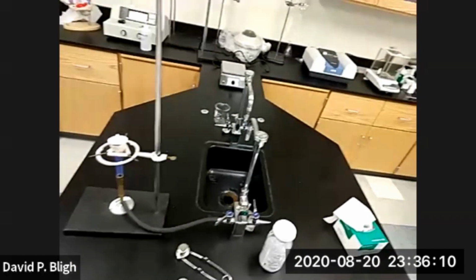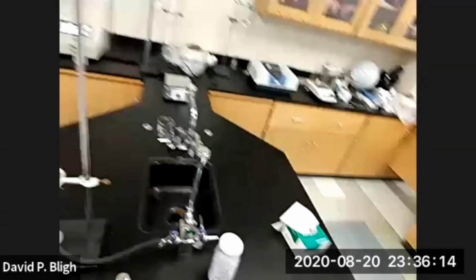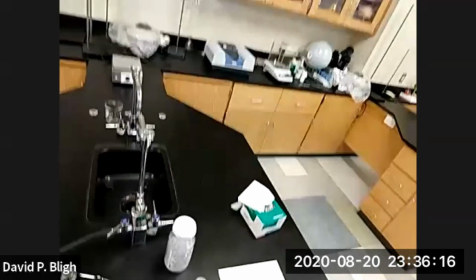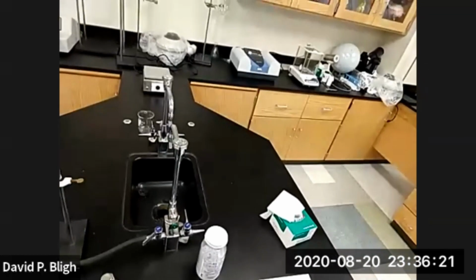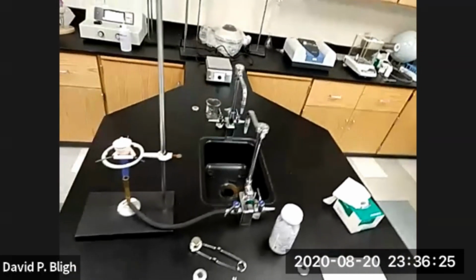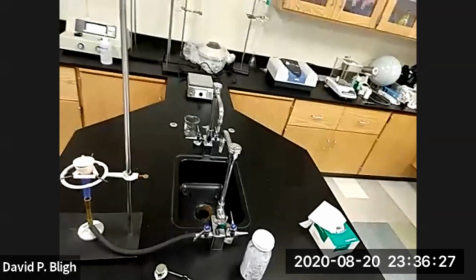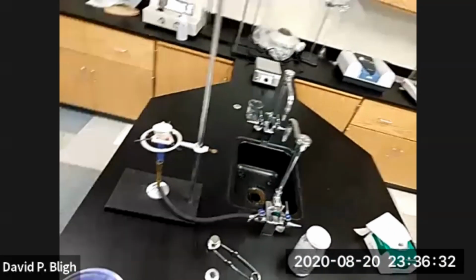So we're going to add the material directly into the cooled crucible after we weigh the crucible. We need to know how much the container weighs. Then when we add the substance into the crucible, we can tell how much we've added by the difference in the two weights.